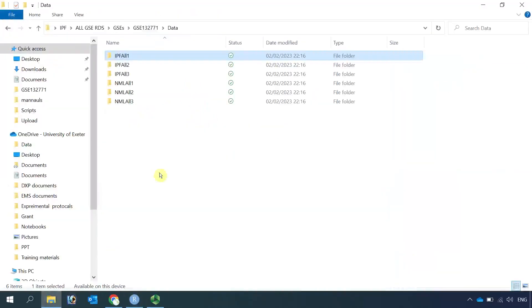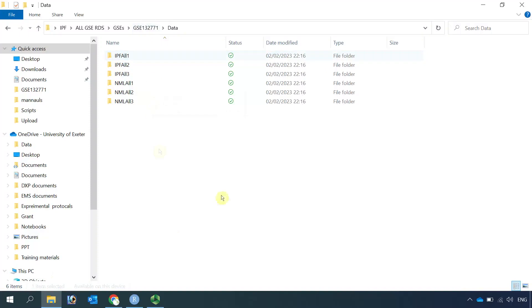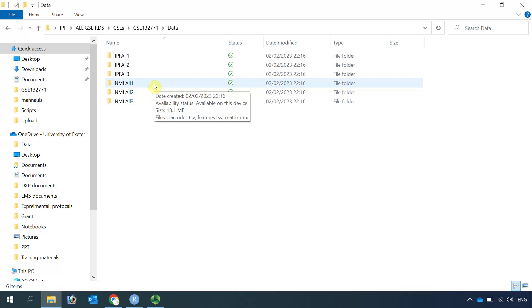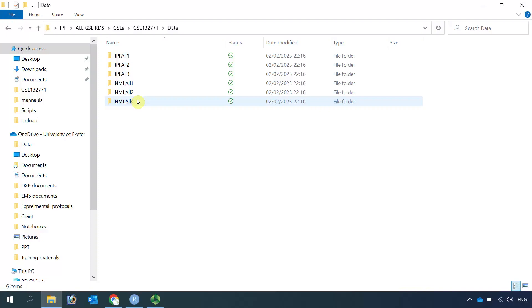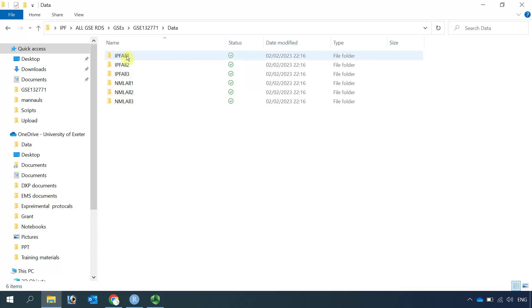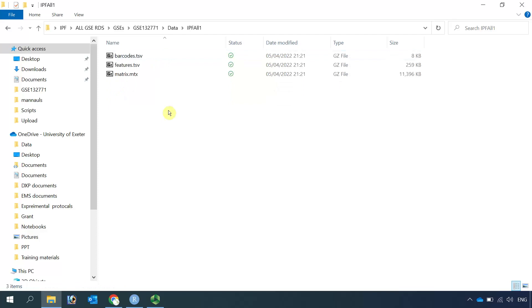If you have a look at my folder for the GSE132771 dataset, I downloaded three repeats of single-cell RNA sequencing data for healthy human lung tissue and also three repeats of single-cell RNA sequencing data for human fibrotic lung. If we open one dataset, you can see we have the compressed barcodes, features, and metrics.